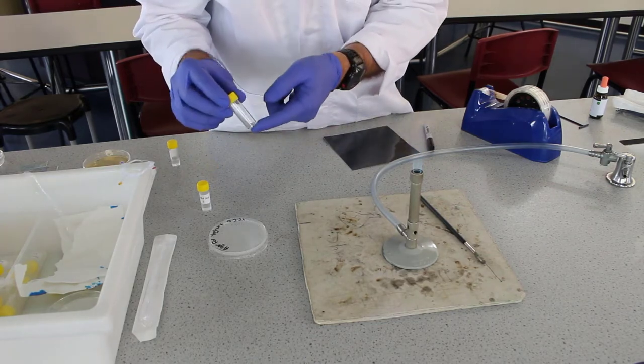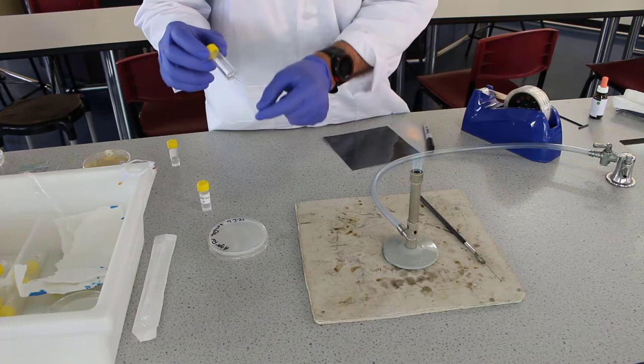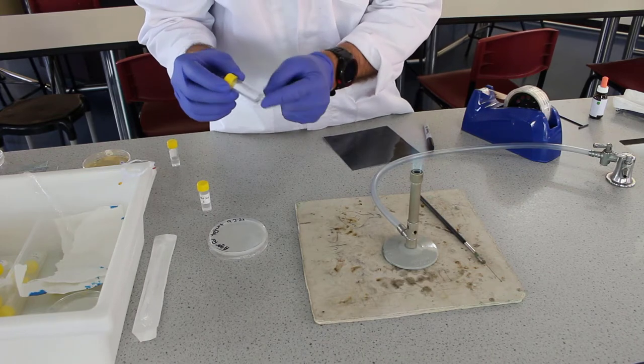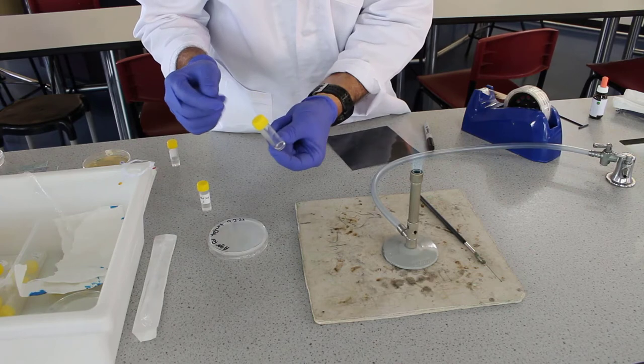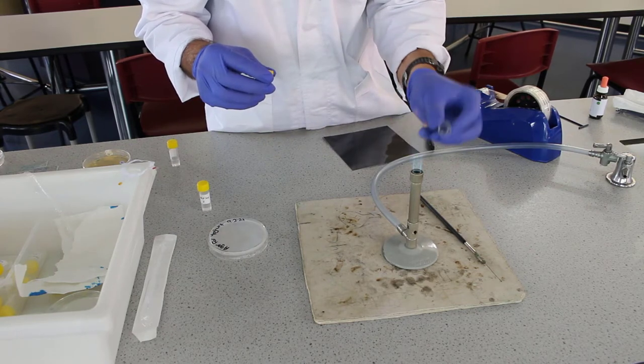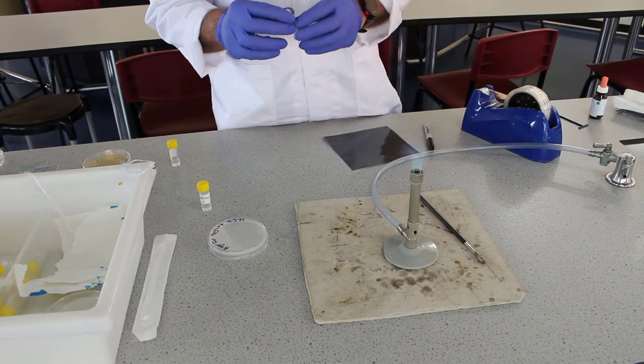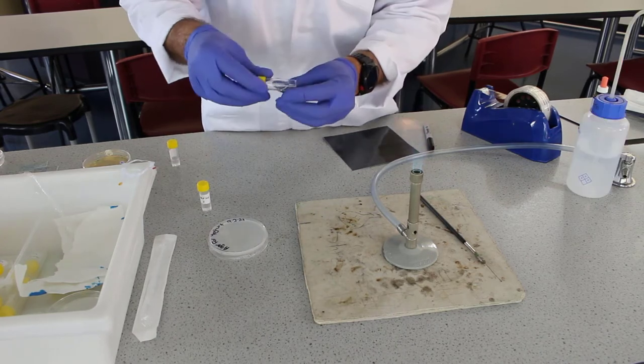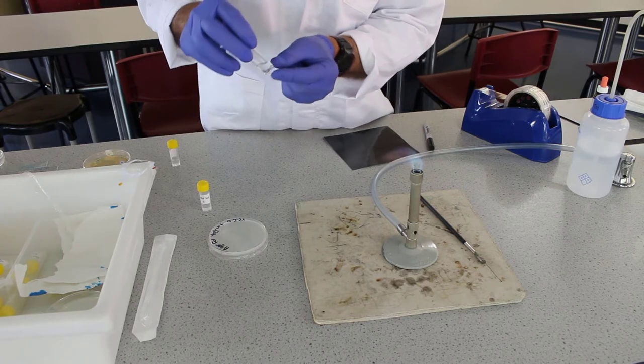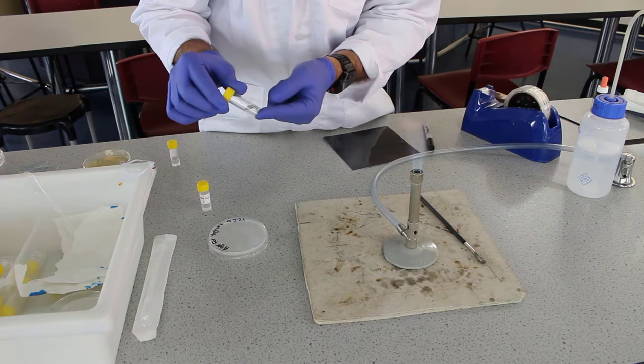The first thing we need to do is prepare our suspension that we're going to use to inoculate the plate. We're going to take a small vial and we're going to flame the neck. Because this is plastic we need to be careful we don't hold it under for too long. We're just going to put just a few mils of water in it.